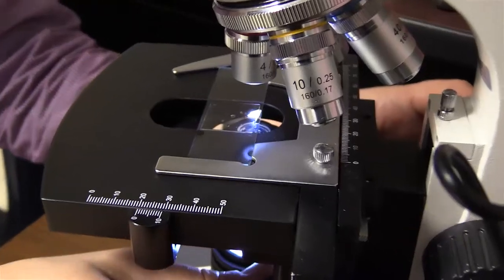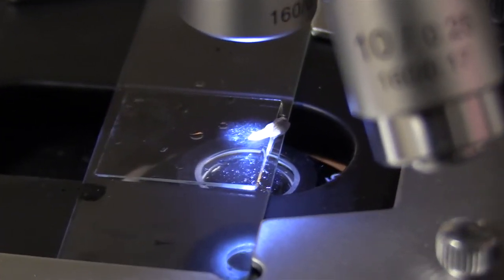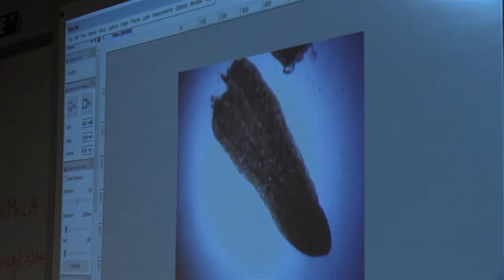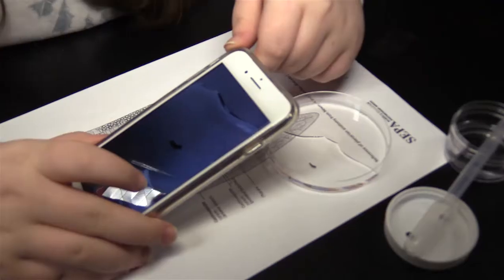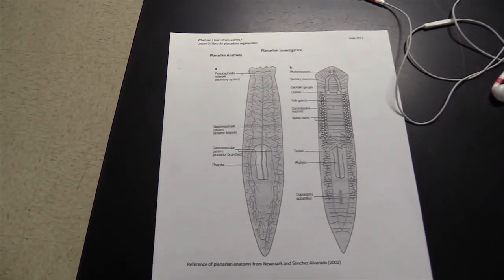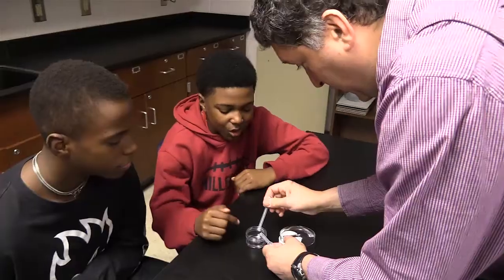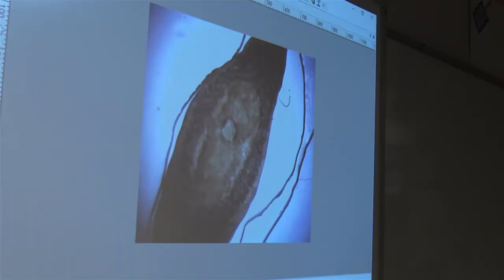Today what they did was they cut a planarian worm in half and they can see how the worm regenerates. The fact that they had a high-powered microscope in the classroom meant they were able to actually see this worm up close, as opposed to what was done in the past, which was using their cell phones to get maybe a photo that is ten times what the eye can see. The microscope can go up to 1,200 or 1,500 times — they can look at cells now.